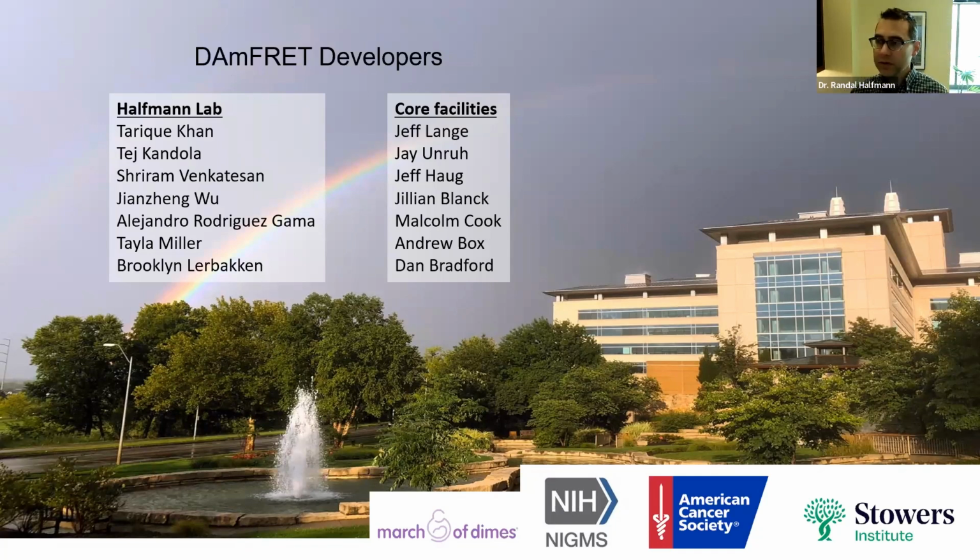So in the case of TDP43, we tried multiple other things. Well, we didn't try that many things. We tried super resolution imaging. So we tried STED microscopy, and we could not see anything. And I think the reason for that is that the phase boundary concentration is so high that you just can't distinguish.